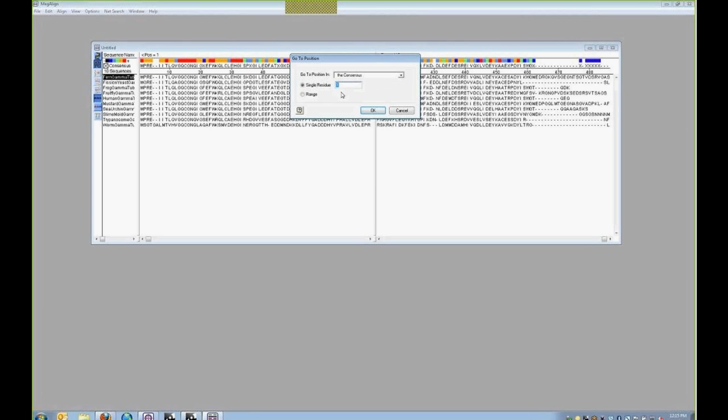In this case, I'm going to choose the consensus, and I'm going to select a range from 1 to 415. I'm choosing 415 as opposed to 400 simply because I know that there are actually 15 gaps already in the consensus due to the assembly that we ran. So if I had just selected the first 400, it would actually only select 385 residues.